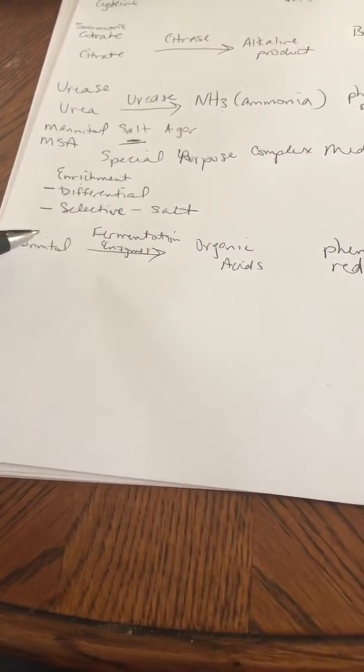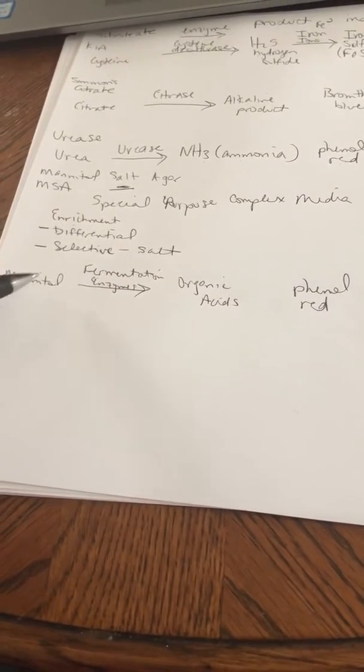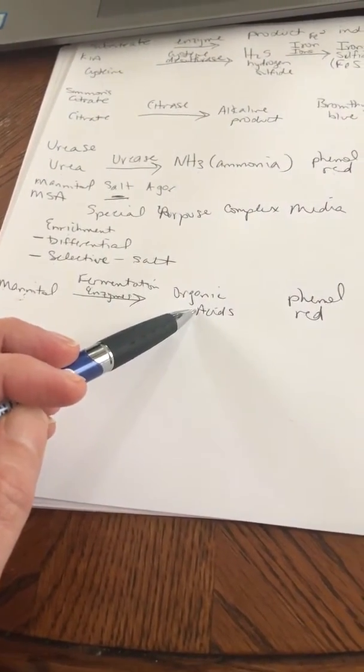So some of your bacteria won't have grown in this media because of the high salt. And then if it did, we would look to see whether it turned it yellow or whether it turned it magenta to see if it can grow, does it ferment this mannitol, and does it create organic acids as a byproduct.